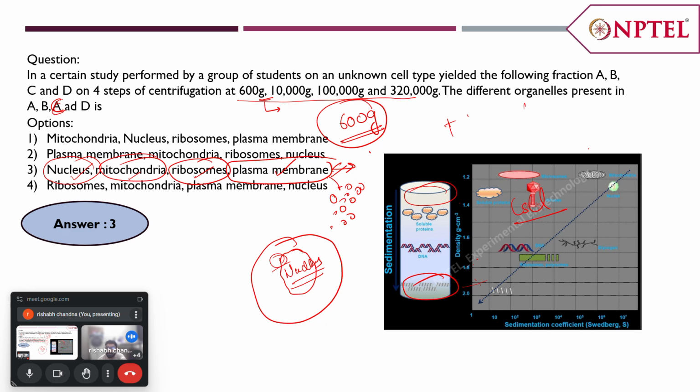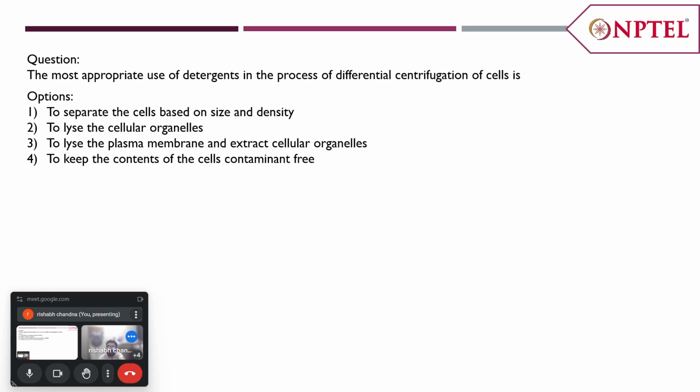If not, then we'll move on to the next question. The most appropriate use of detergents in the process of differential centrifugation of cells is, what can be the correct answer?